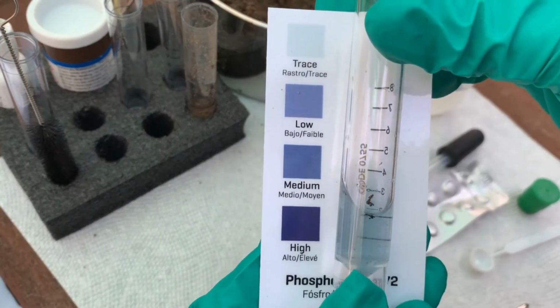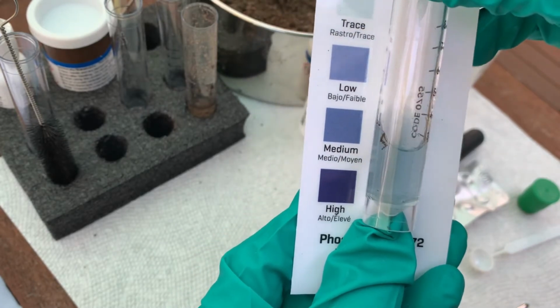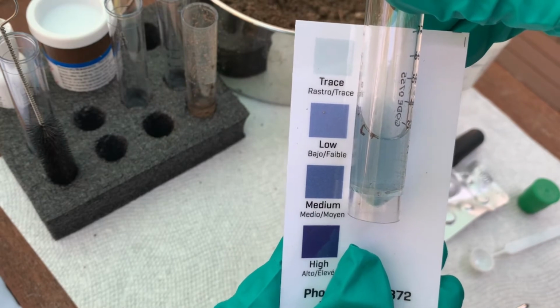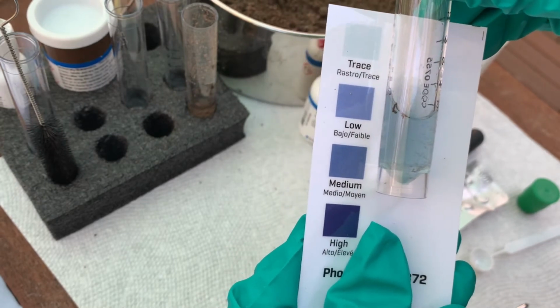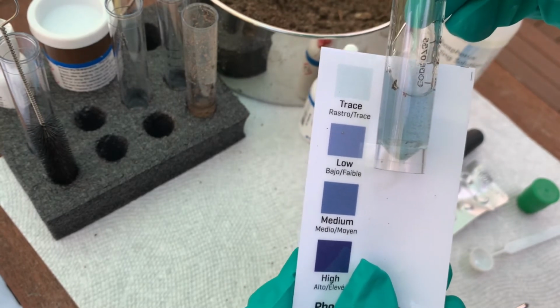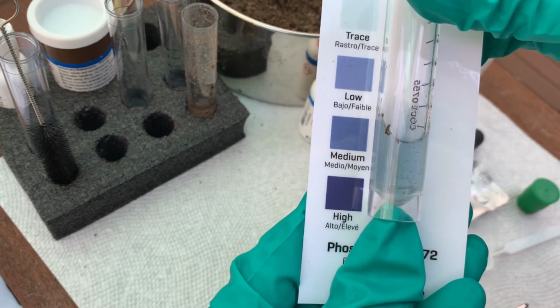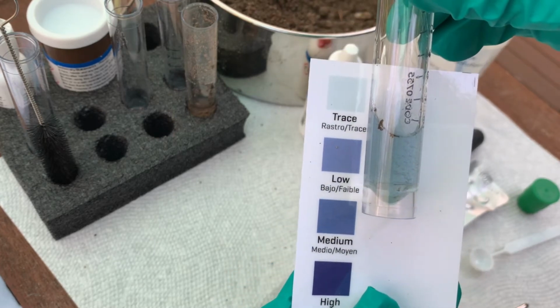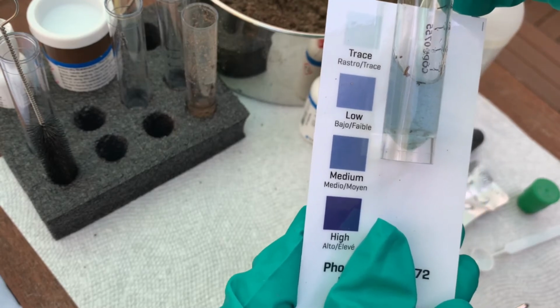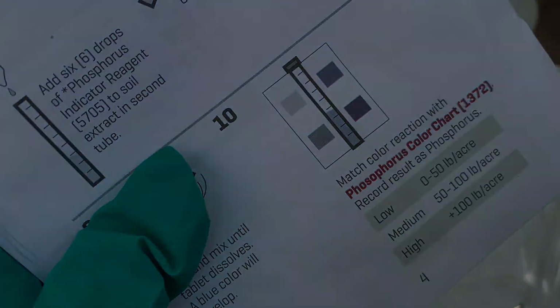Now we hold it up to our phosphorus color chart, and again, you're looking at the two different colors each time and deciding if it's closer to one or the other. And then look on both sides of that color, and then you'll come up with whatever you think is closest. In this case, I think low is closest, 0 to 50 pounds per acre. But because it's not on the trace level, I won't go with zero, I'll go with 50.